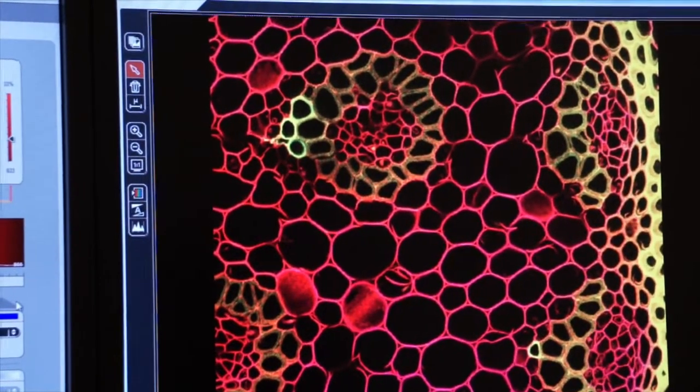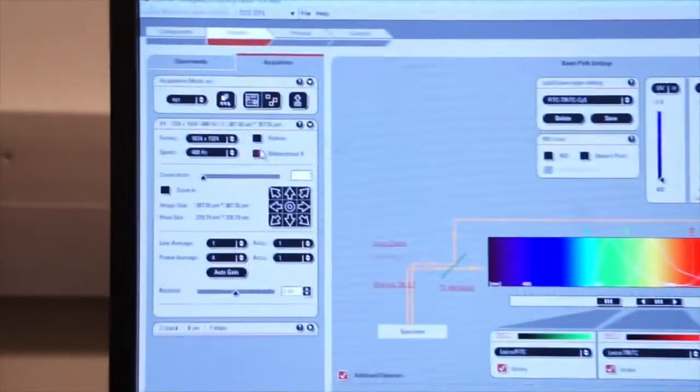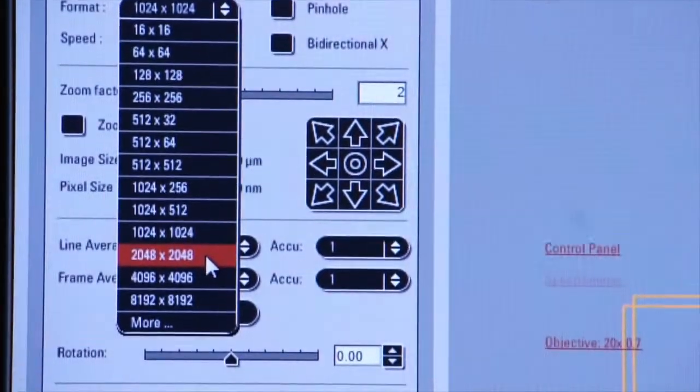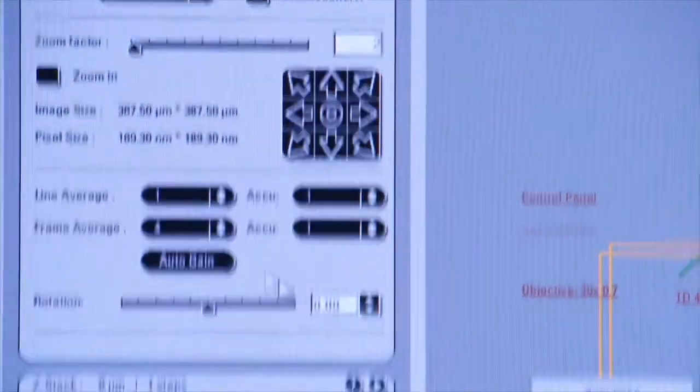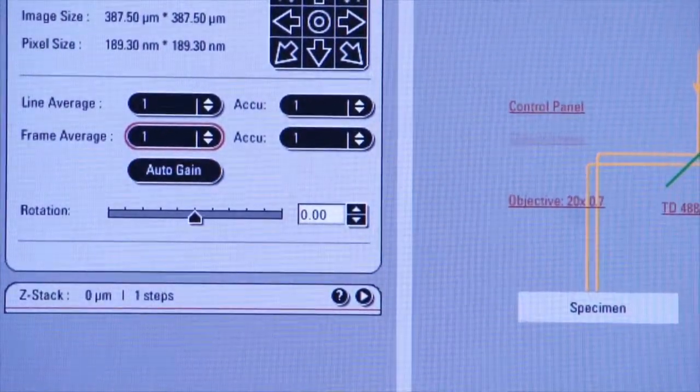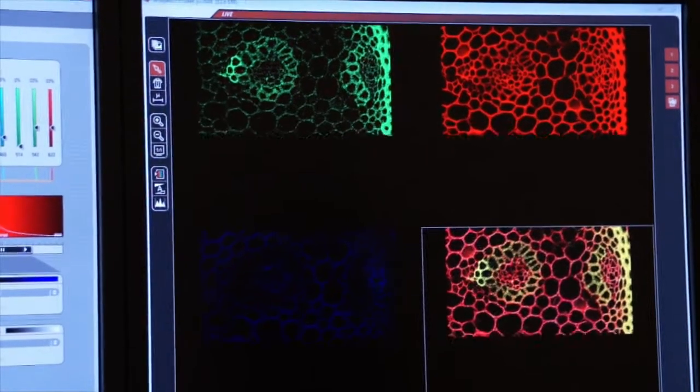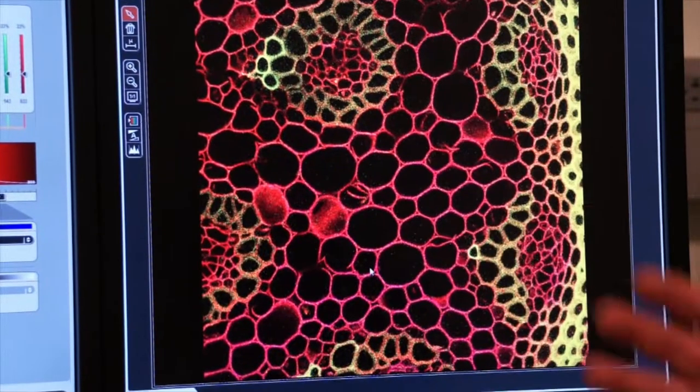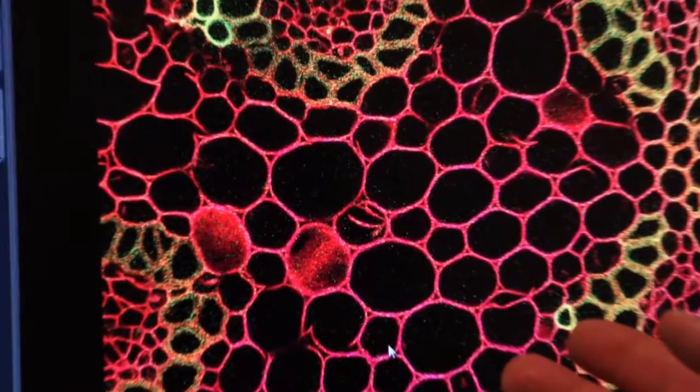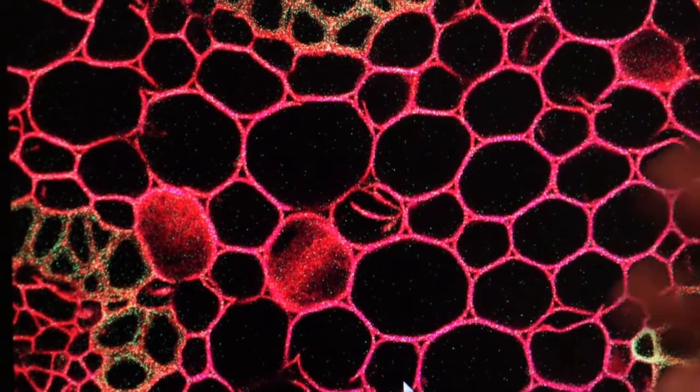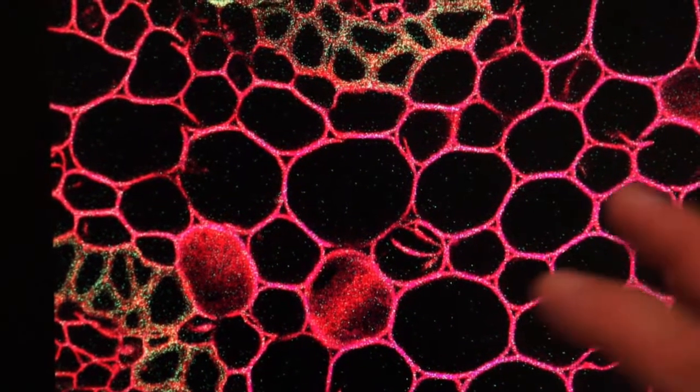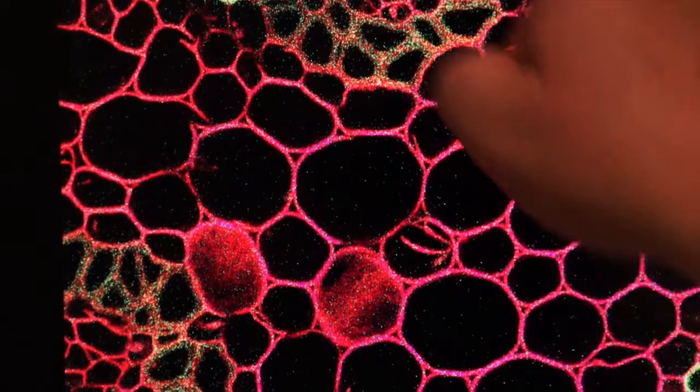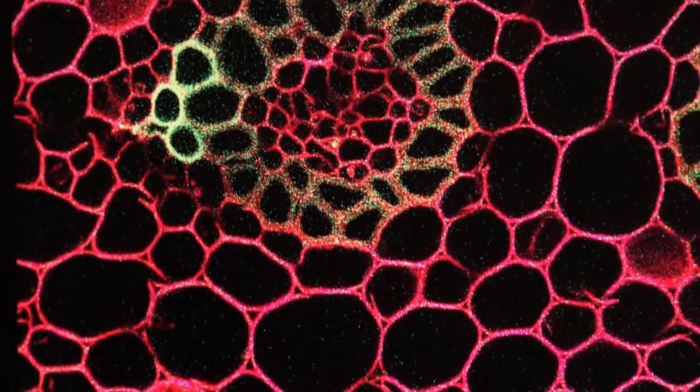Let's try it again only this time we're going to increase our resolution even more. So I come up here to resolution, let's do a 2k by 2k image and we will change frame averaging back to one. Let's just capture an image at 2k by 2k and you'll see how grainy this is. But you might say well Mark we increased our resolution how can it be grainy? Well again there's noise in the system and so by using line and frame average we can eliminate some of that noise, reduce some of this pixelation and increase the resolution of our image.